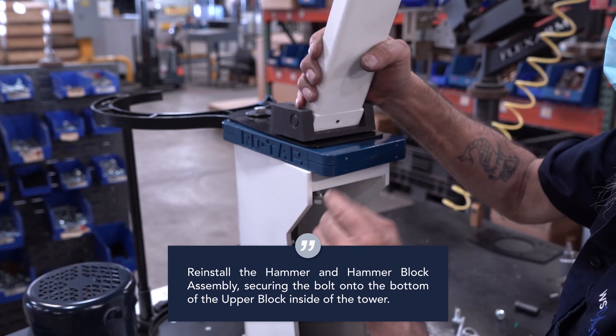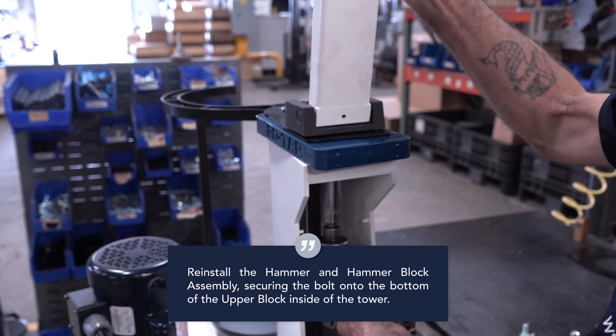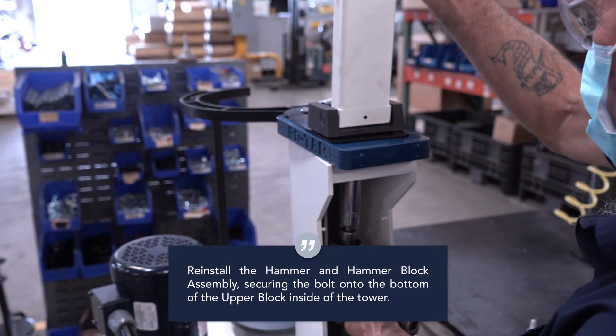Finally, reinstall the hammer and hammer block assembly, securing the bolt onto the bottom of the upper block inside of the tower.